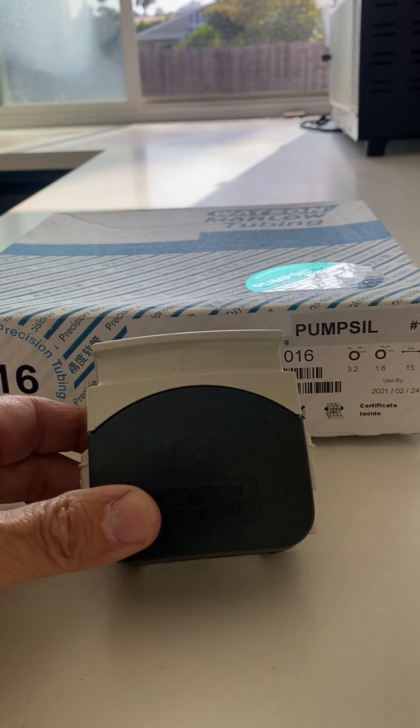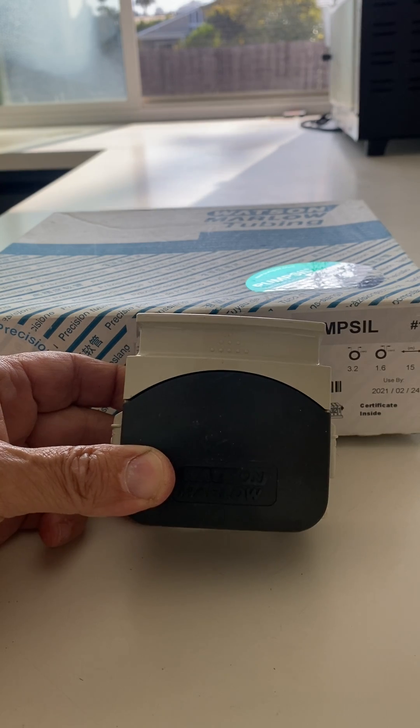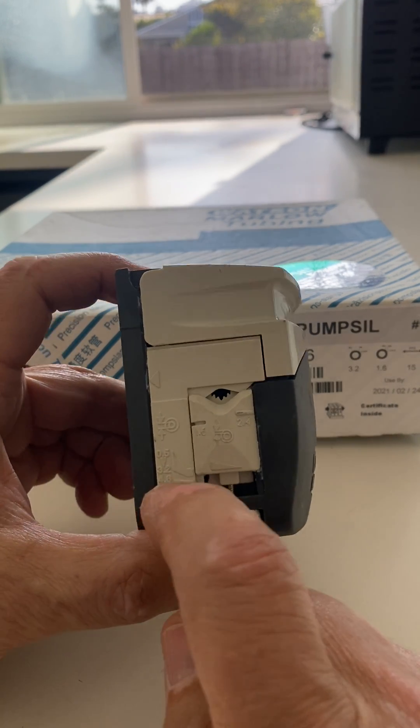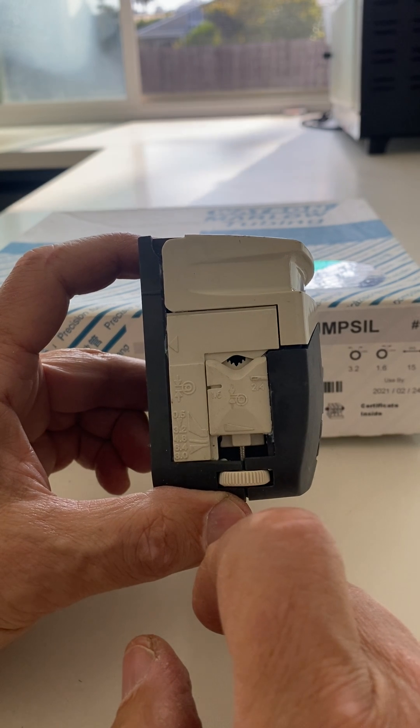This is how to adjust the Watson Marlowe 300 series pump heads for your tubing. These pump heads have marks on the side, and the labels are for the ID of your tubing in millimeters.